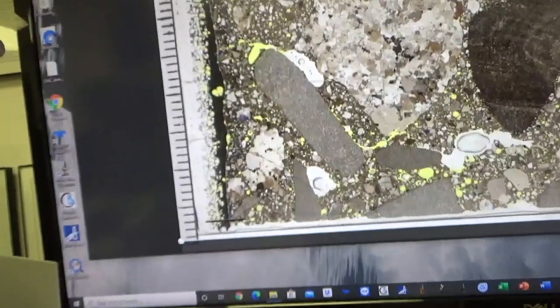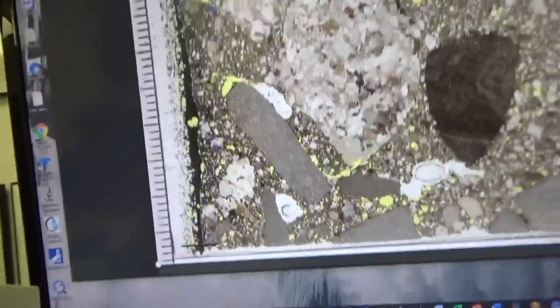Here is the scale bar. You can see the scale bar, that JPEG with scale bar that the Microvisioneer manual whole slide image software gave you. And I still have the scale bar with my transparent scale bar, so I can see the millimeter scale.